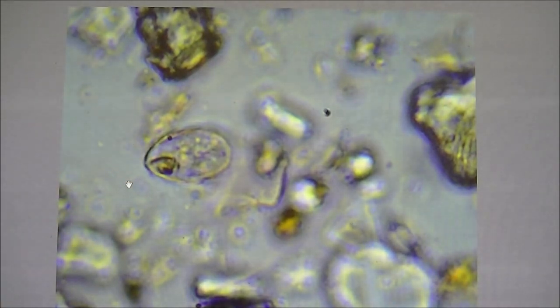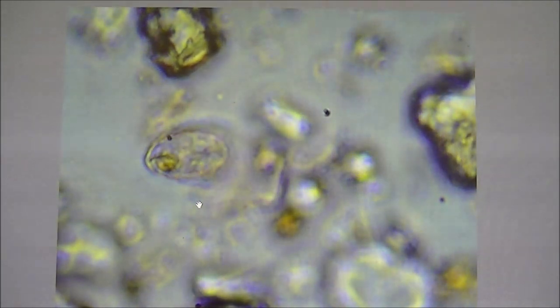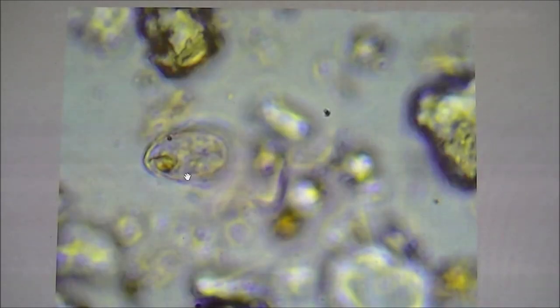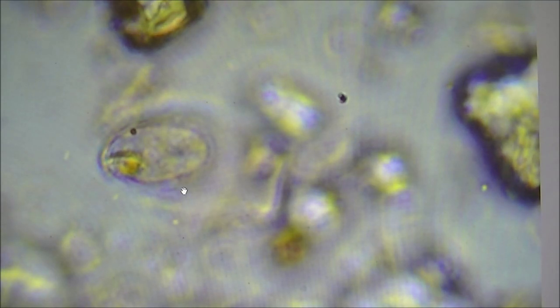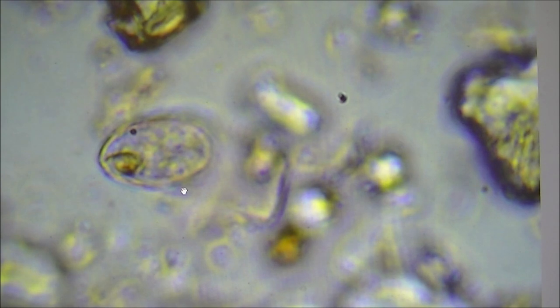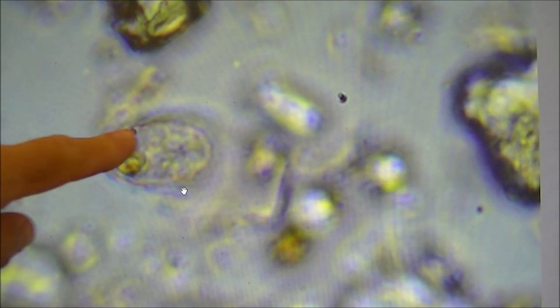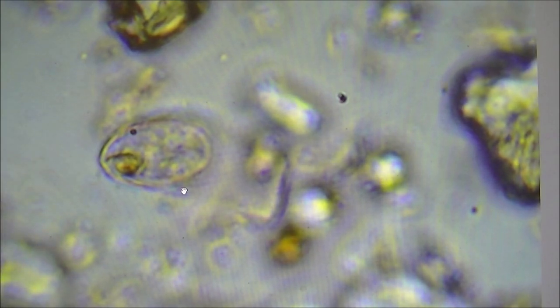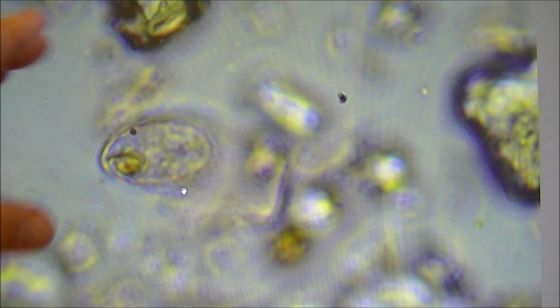Now this is fantastic to have. This is the main one, it's almost like a nematode. When it eats everything and poops it out, it releases plant available nutrients instantly for your plants, and this is what you want to find. This is fantastic to have. Inside the belly here you can see just a little bit of the remnants of some bacteria. There's tiny little hairs on the outside that move this along, almost like a little submarine. These hairs just move up and down and it just swims along inside the water here.